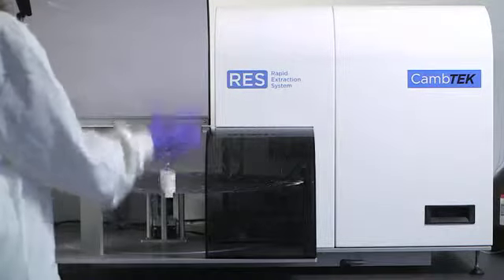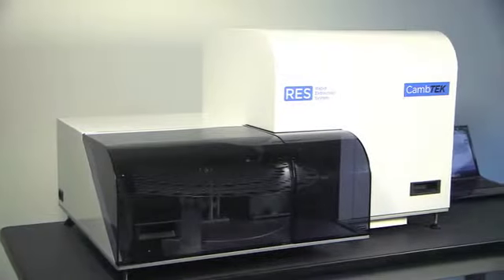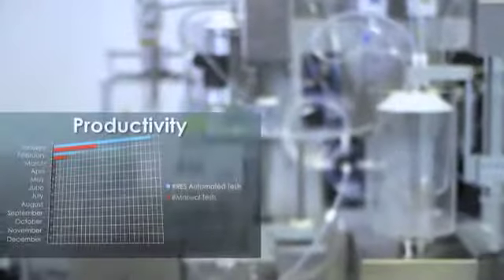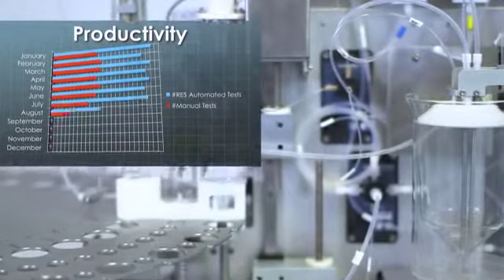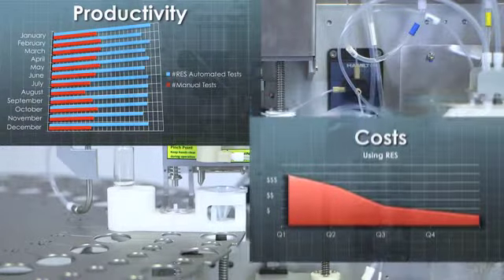Engineered specifically for analytical R&D and QA/QC laboratories, it improves quality of data, increases productivity, standardizes quality control processes across organizations, improves laboratory safety, and delivers measurable economic benefits.